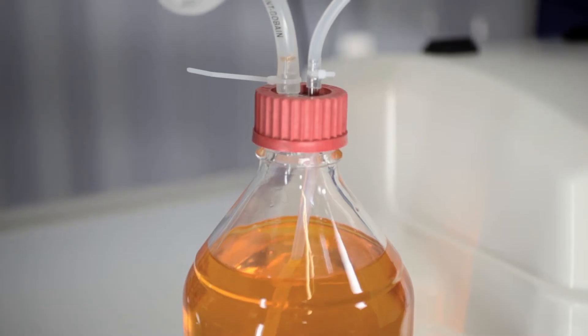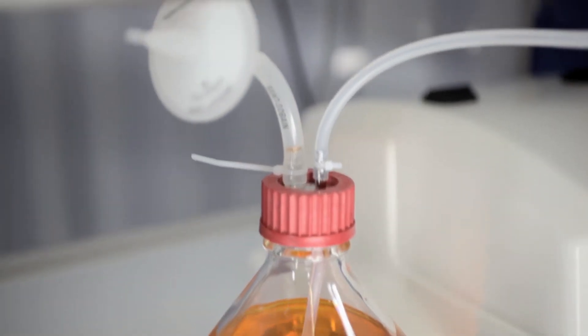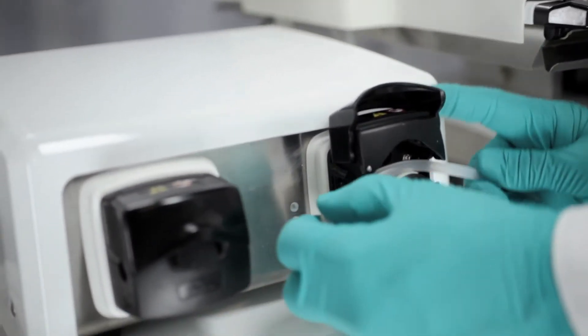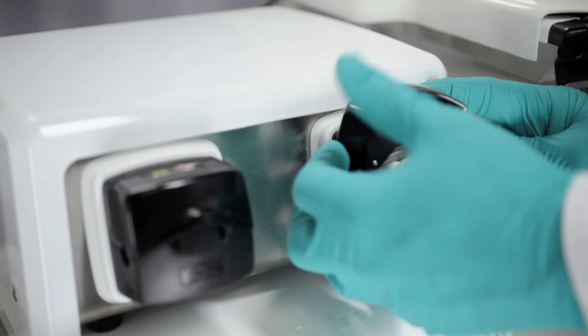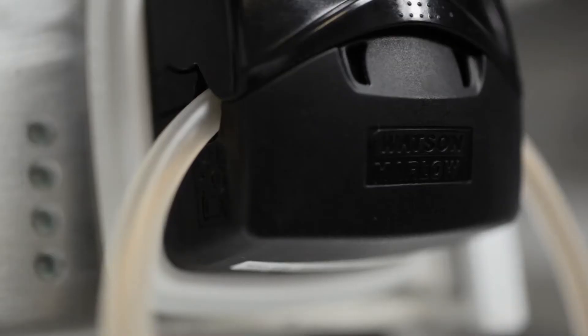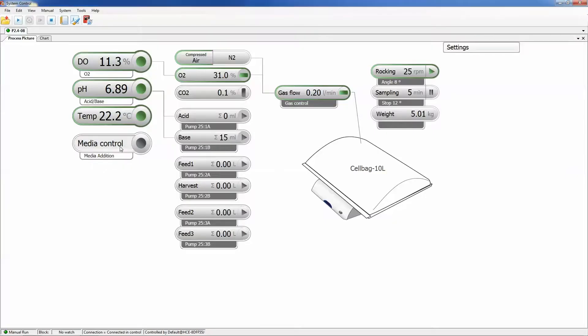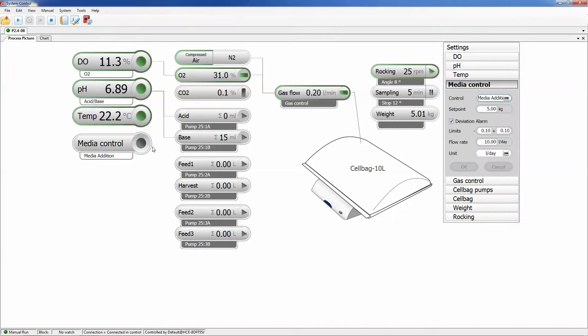For accurate media handling or nutrient supply, the system pump is controlled by weight feedback from the integrated scale. Culture medium is automatically added to a volume predefined by the user. The wide flow rate range of the system pump allows for liquid additions in the range from milliliter to liter scale.